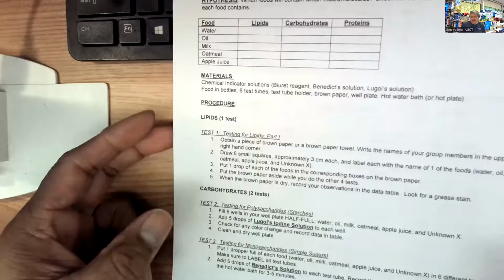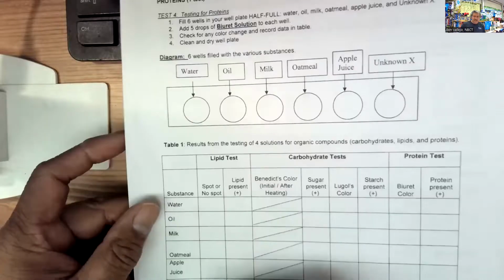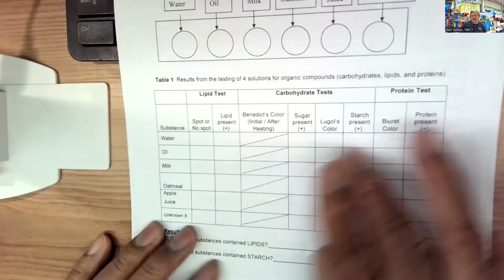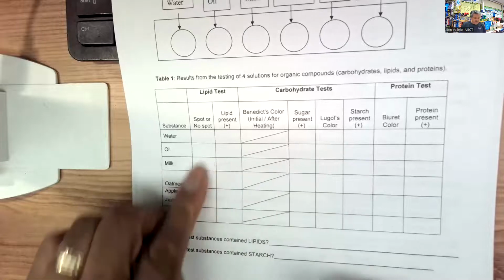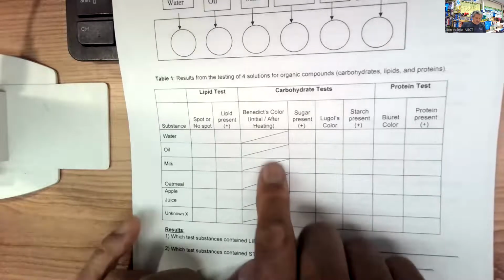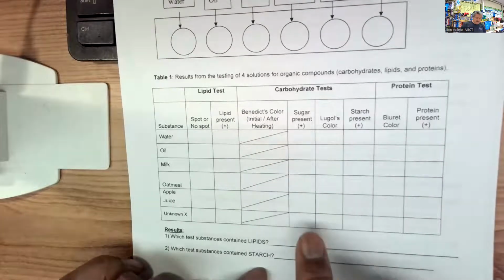All right, so let's go ahead and do the test. Here are all the procedures in the handout that you can see here. Also, we need you to complete this table. There's a table here for you to record whether, on the first test, it leaves a spot or not. And then on the other tests, the color right here.